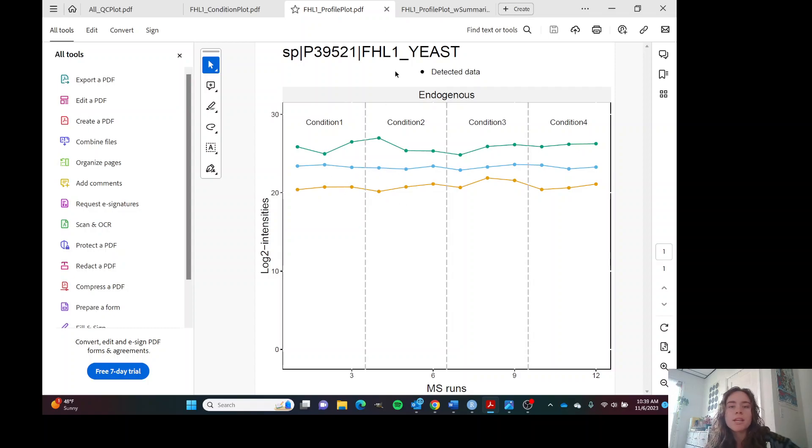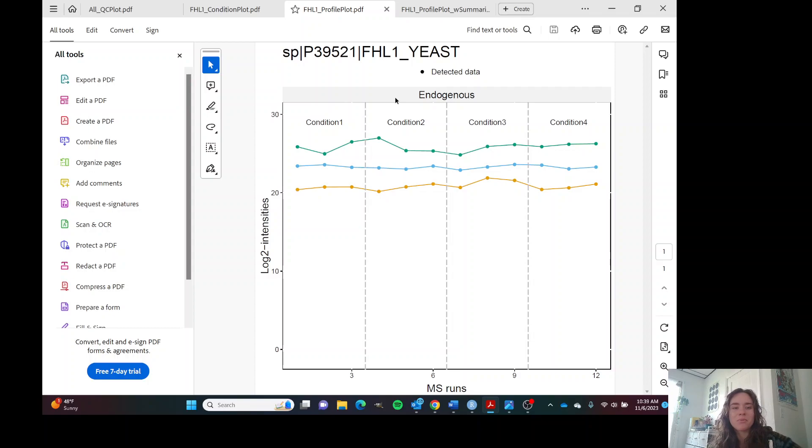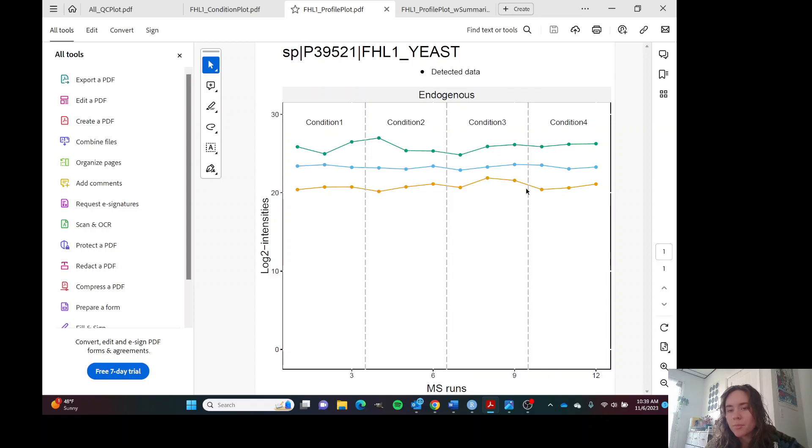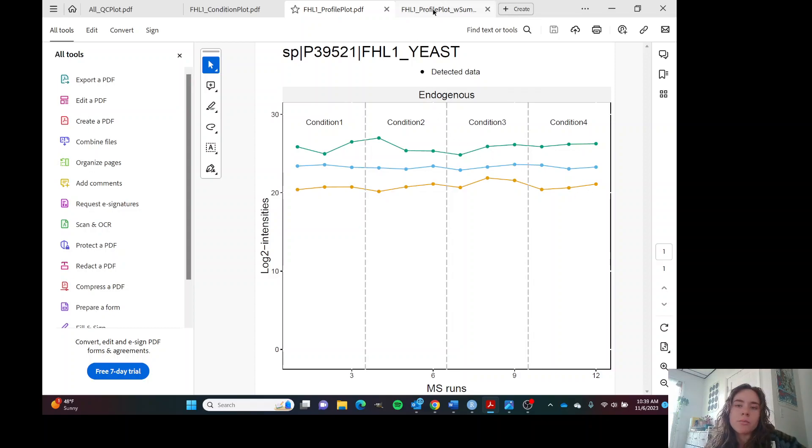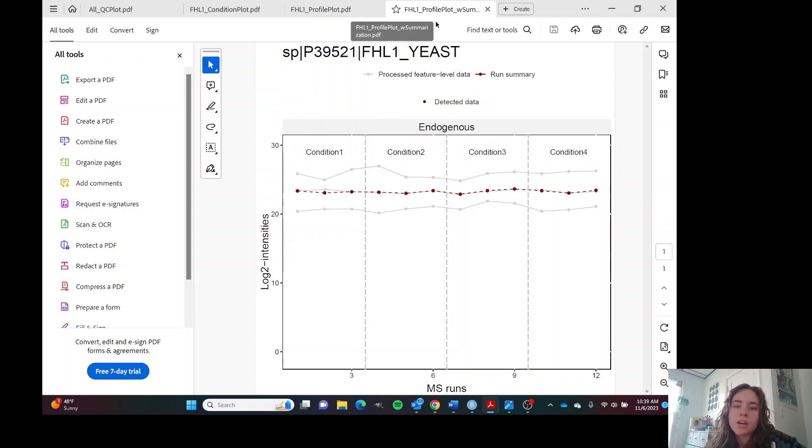We want to make sure that our mass spectrometer ran properly for every single run that it did, which doesn't always happen. But it looks like it happened in this case. It looks like all our mass spec runs are good and we can get a summary of our runs here.